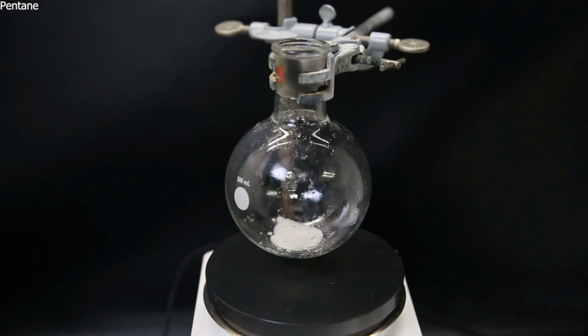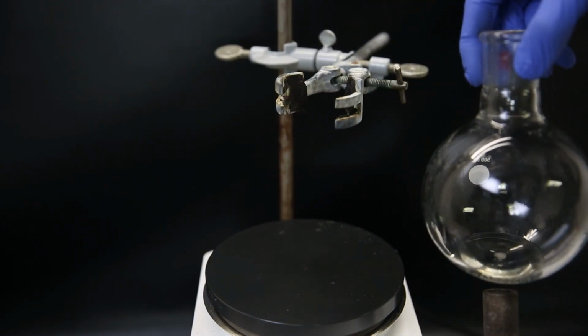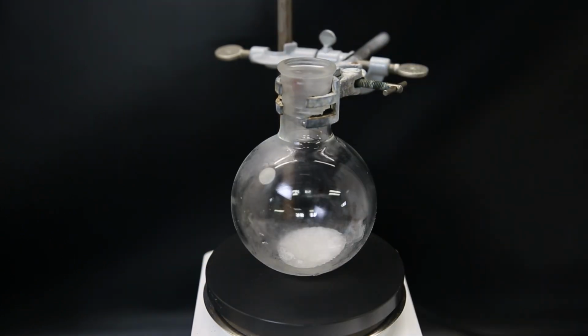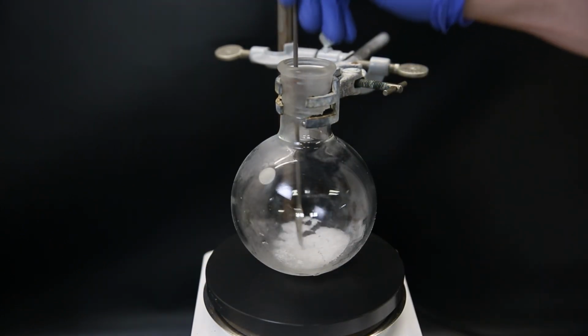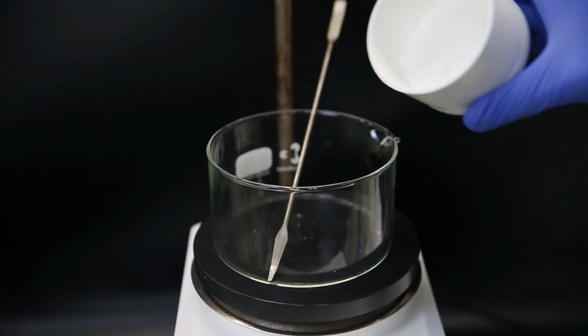I then recrystallize the product by dissolving it in some boiling pentane. I boil the pentane with a heat gun, and when it has all dissolved, I set it in the freezer at -20 °C. It has all crystallized out, but also trapped the pentane, so I filter it through a paper filter with vacuum filtration and wash it with a little bit of cold pentane. I leave it to dry on the filter for a while, so that all of the pentane evaporates.